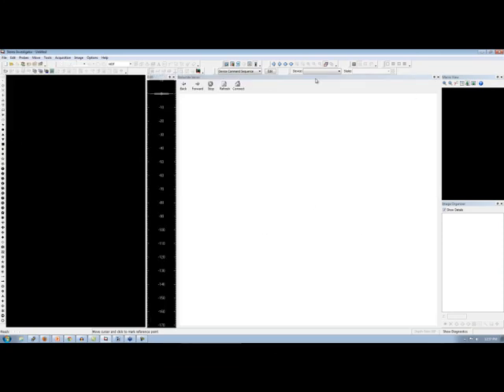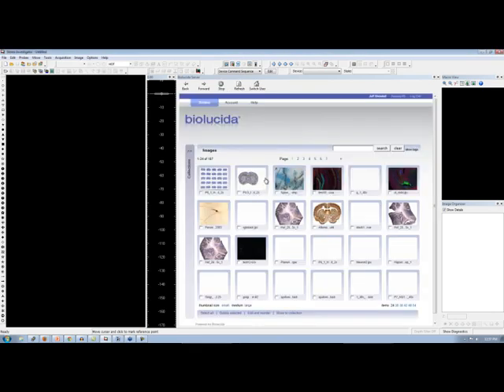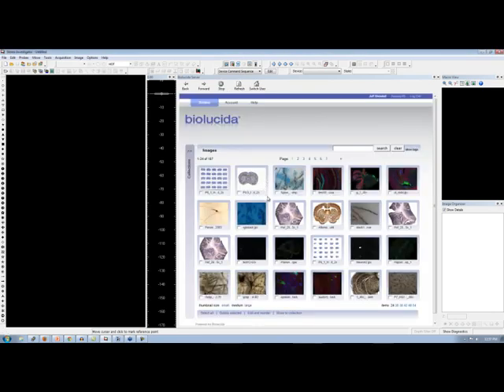We have a large docking window that comes up now. I'm going to hit the Connect button. A dialog pops up. It's already filled with my information because I've logged in before, so I'm just going to hit OK. And that automatically logs us into the system.